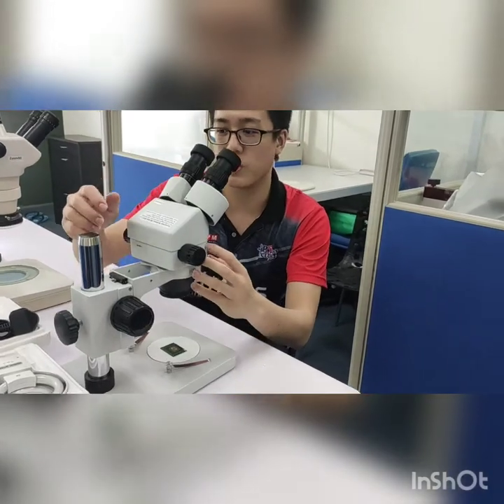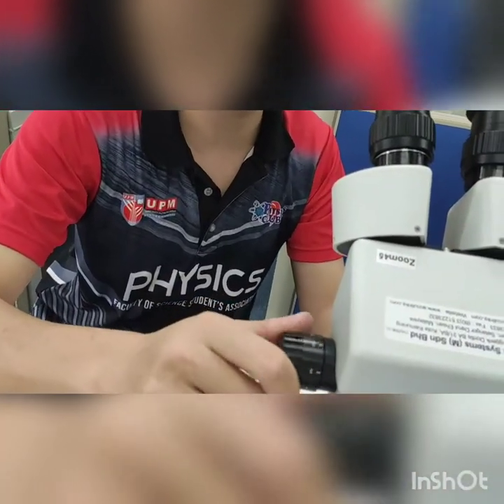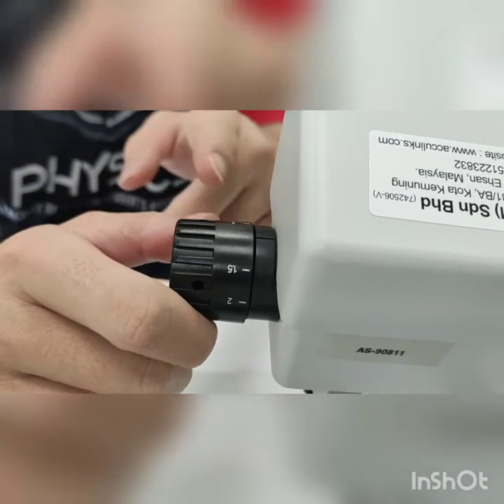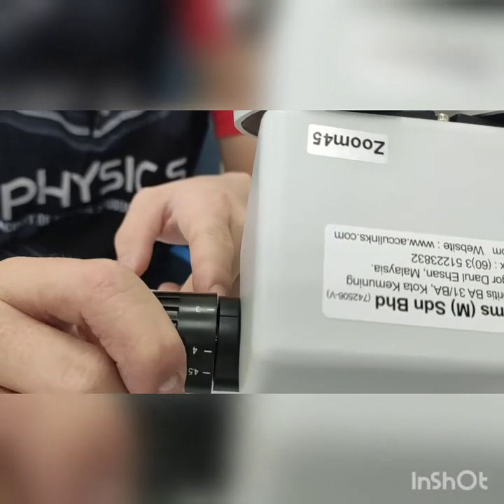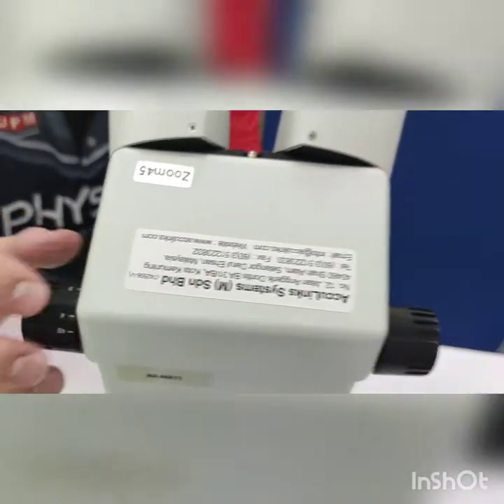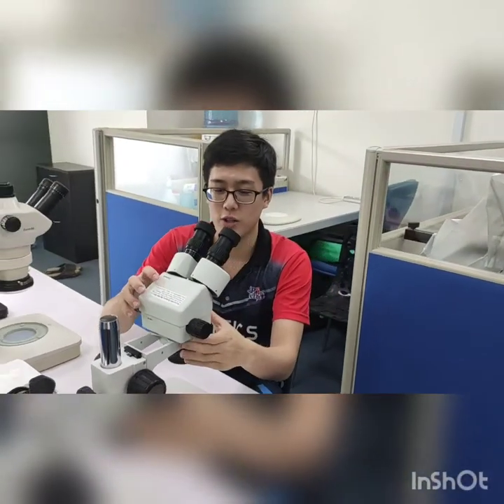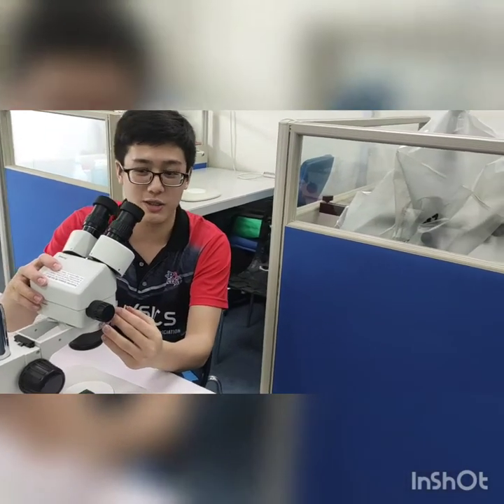Next, we look at this part. This part is what we call a magnification changer. Of course, when we turn it, we can go from one magnification to 1.5, 2, 3 and so on. Then next, we look at this body. This is the microscope body, which has the objective lens.